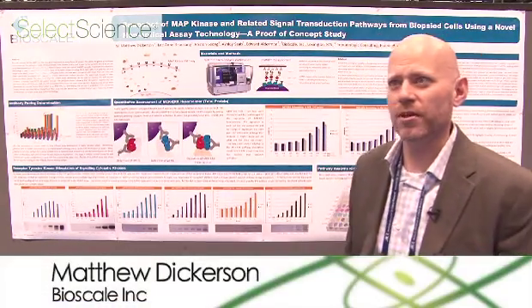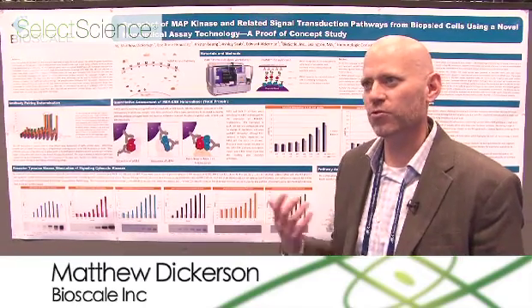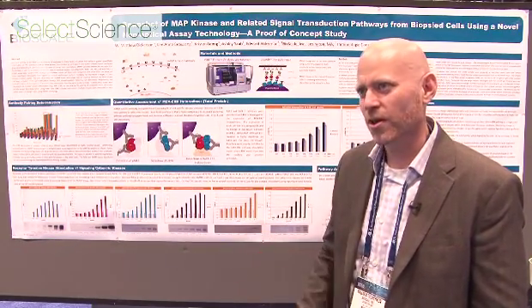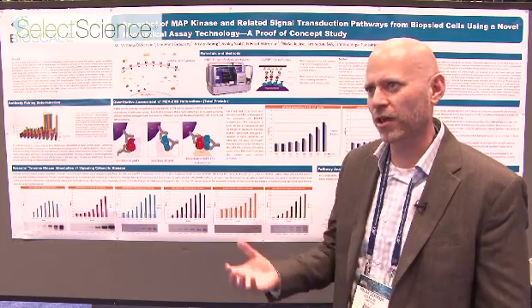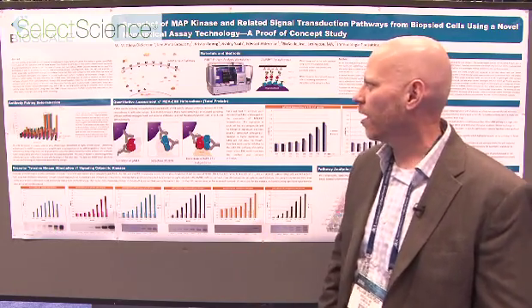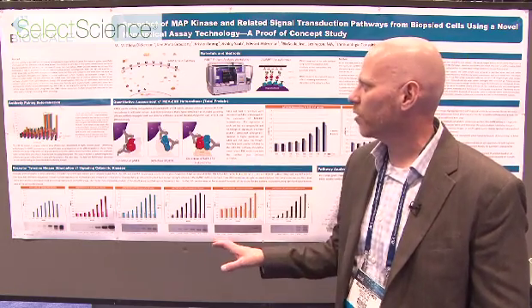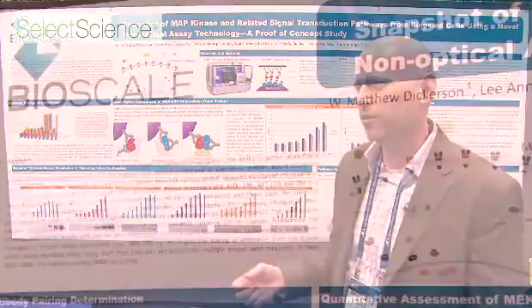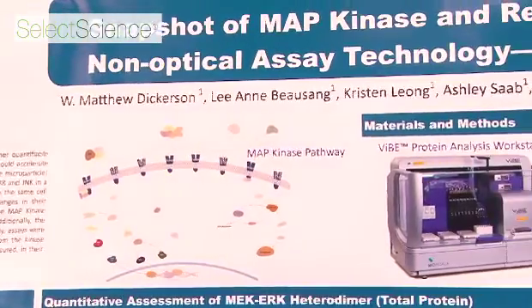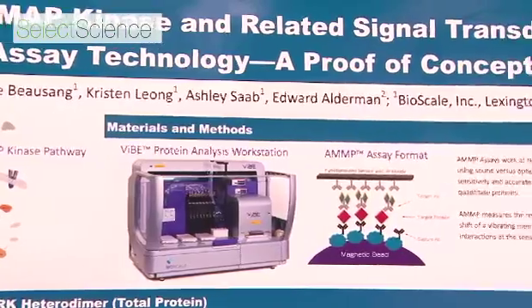I'm a lead scientist at BioScale, working with the company for several years developing this new technology to analyze protein and protein interactions, specifically around cell lysates and kinases and those kinds of things. This poster is some development work that we've been doing internally to understand how we can use the platform to really do a large analysis of kinase activity, specifically around oncology.